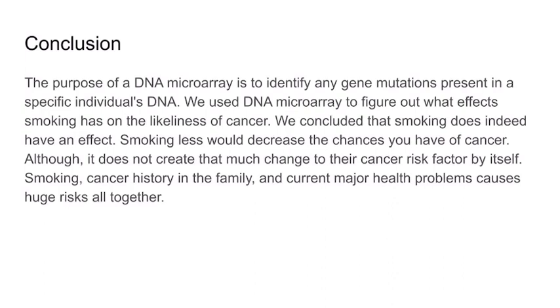Conclusion. The purpose of DNA microarray is to identify any gene mutations present in a specific individual's DNA. We use DNA microarray to figure out what effect smoking has on the likeliness of cancer. We concluded that smoking does indeed have an effect. Smoking less would decrease the chances you have of cancer, although it does not create that much change to their cancer risk factor by itself. Smoking, cancer history in the family, and current major health problems cause huge risks altogether.